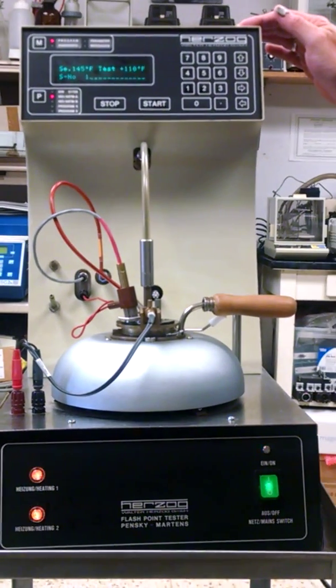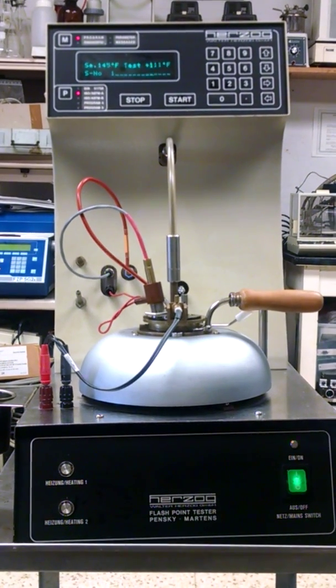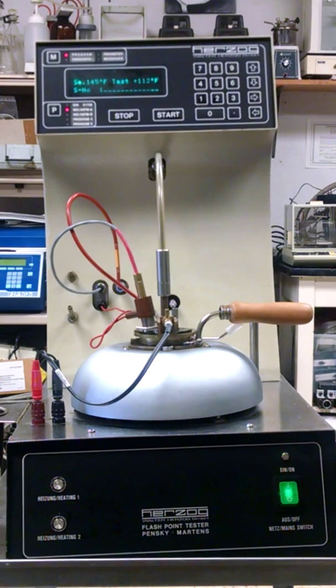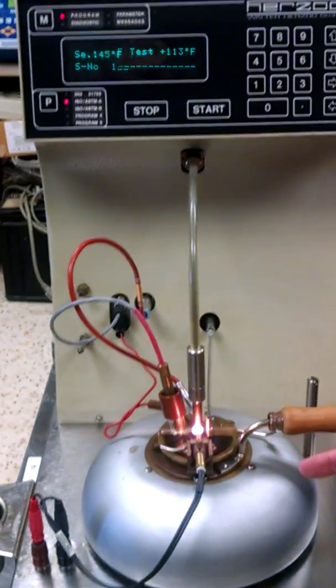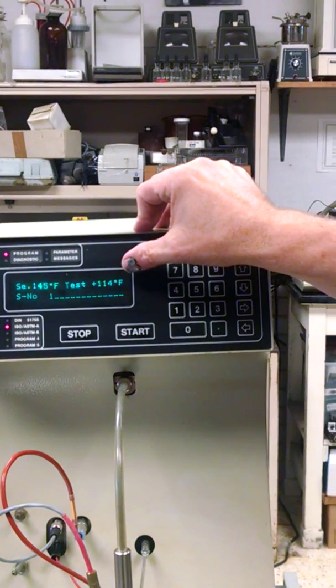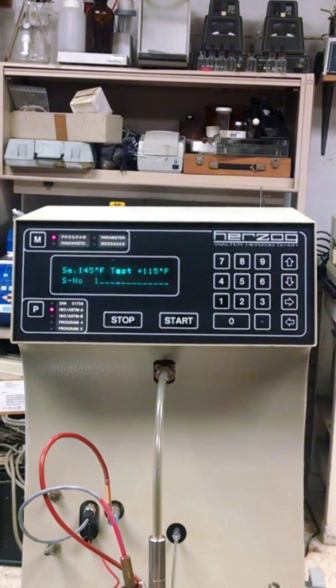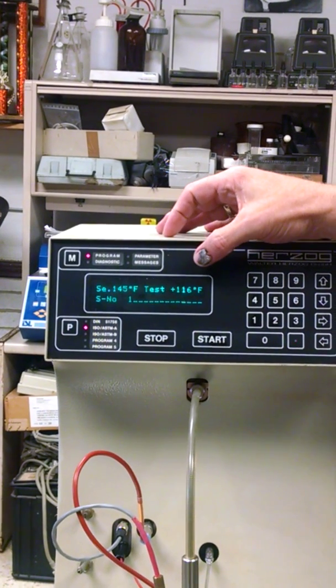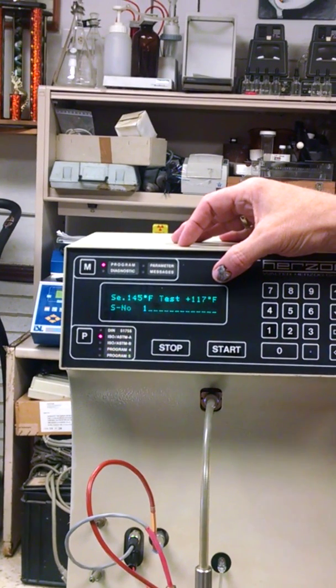We're at 110. It should start to flash here I think any time. Like I said, we've got four warehouses on Texas Avenue. Oh, and now you can see it's starting to lit up and it tried to flash. Now it'll do that every two degrees. Now it's at 113. Now you'll see at 115 it's starting to glow. And at 115 it'll reach down and try to flash again. See, it's not getting a flash. So it's going to keep going up and it'll test every two degrees until it actually flashes. So we're at 117.